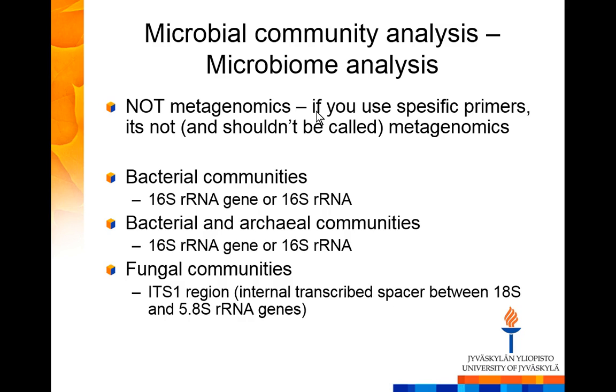What you need to remember is that this is not metagenomics. There are commercial products that call 16S sequencing metagenomics, but that's not the agreed use of the term in the scientific fields. So it's microbiome analysis or amplicon sequencing. Metagenomics is something that we will learn later this week.